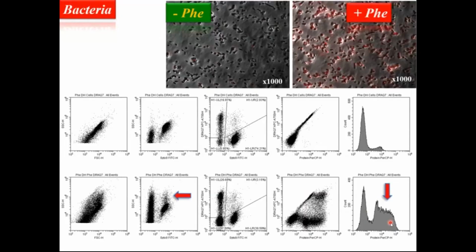If we look only at those events that are alive and happy, if we start to gate them, we can see the profile change completely. These proteins tend to aggregate, looking like they were positive, but we also have a good amount of dead cells coming with that protein as well, expressing the same level as this one. So all of these ones are dead. Only these ones are the ones that we are interested in collecting and sorting.